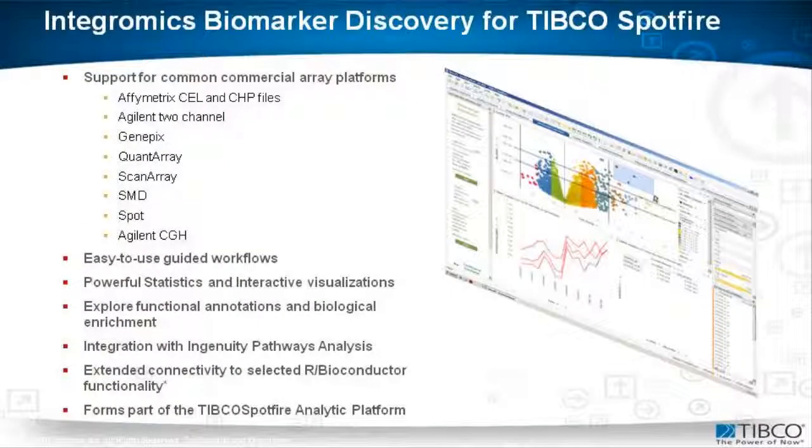IBD supports multiple microarray technology platforms and provides all the required statistical and analysis tools, with optional links to selected R and Bioconductor packages. It also integrates with the rest of the TIBCO Spotfire analytics platform.